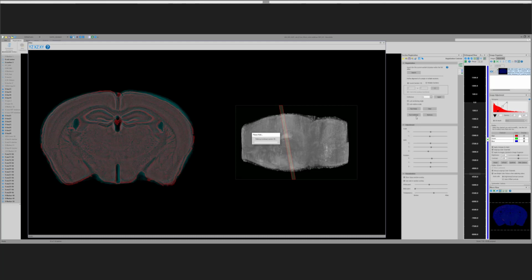And again, Brian, I think you're best describing this. Sure, I'll jump in. As Chip said, the linear registration is really good at finding where in the brain we are, but it doesn't represent all the variation within each section. That's what nonlinear registration does. Instead of the handful of parameters that we have to represent how a knife cuts through the brain, the nonlinear model has hundreds or potentially thousands of parameters. Those parameters enable us to incorporate local adjustments that account for tissue distortion.